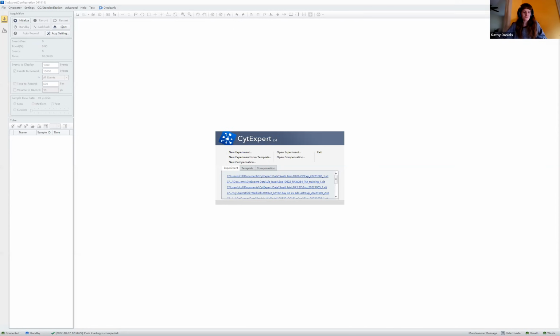Okay, perfect. Thank you so much, Derek. I think we're ready on our end for the CytoFLEX screen to start sharing. I want to reiterate Derek's point to say thank you so much to Anna and Chelsea at the MSKCC Flow Core Lab. They did all the hard work. I'm doing the easy work by doing a remote demonstration of how to run compensation and a multicolor experiment on the CytoFLEX LX using CytExpert. They did all that heavy lifting, and we wouldn't be able to do this session today without them.